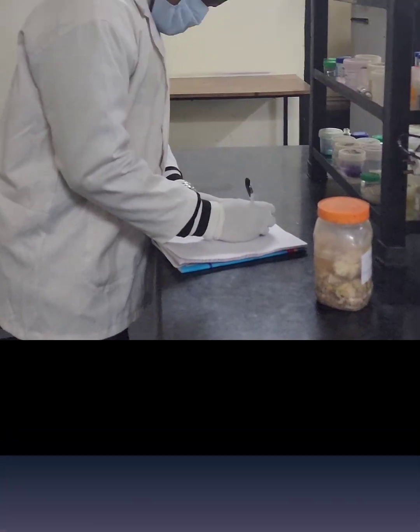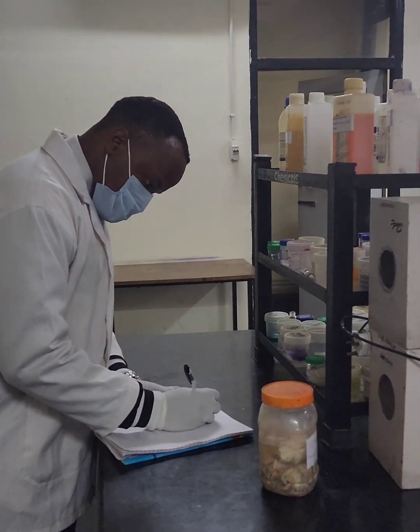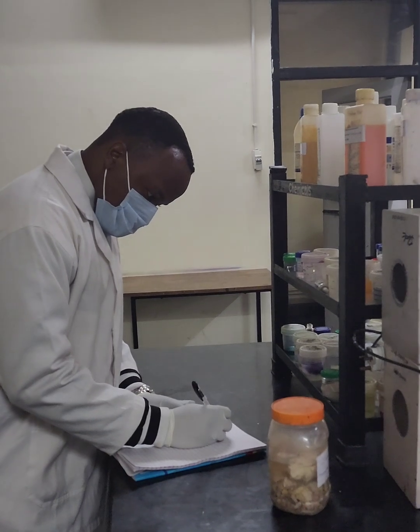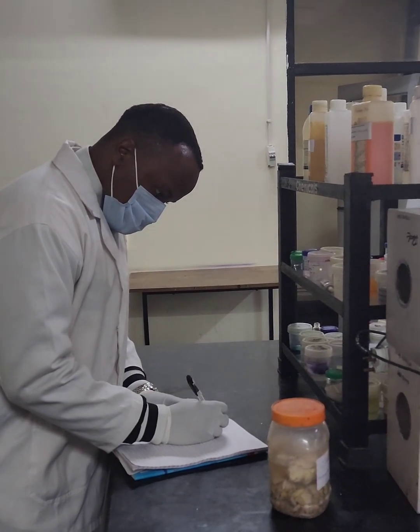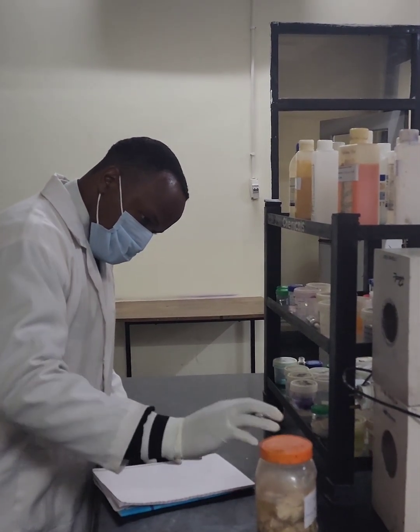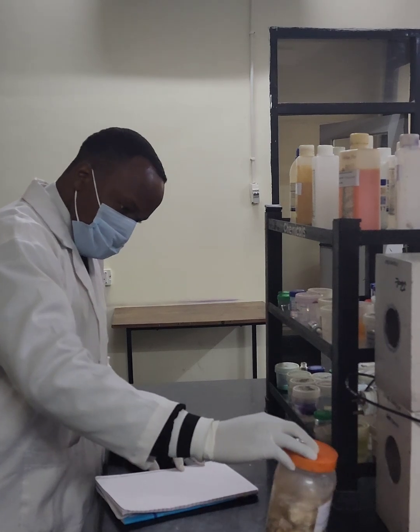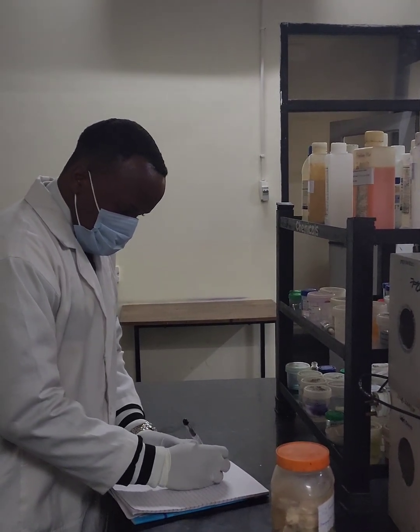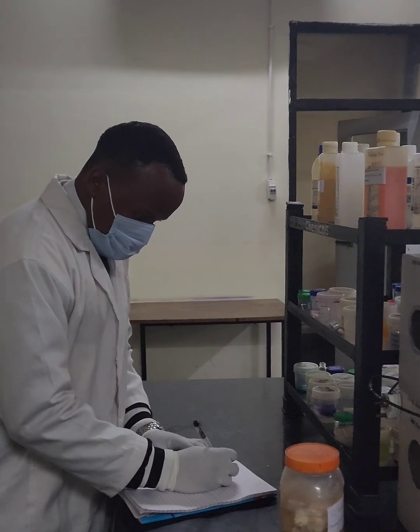The first and important step would be receiving and accessioning, whereby the tissue specimen is allocated a unique identification number in the lab and relevant information is recorded. This will allow us tracking and proper documentation of the tissue specimen.